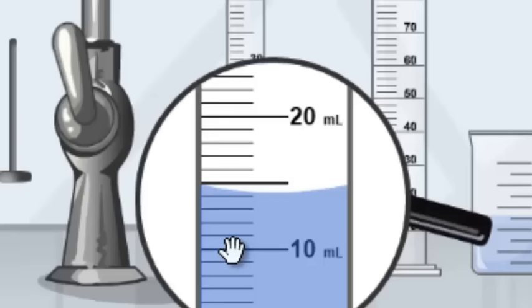If I simply try counting I can go 11, 12, 13, 14, 15, 16, 17, 18, 19, 20. So that tells me that each line is worth 1 milliliter because it all works out.